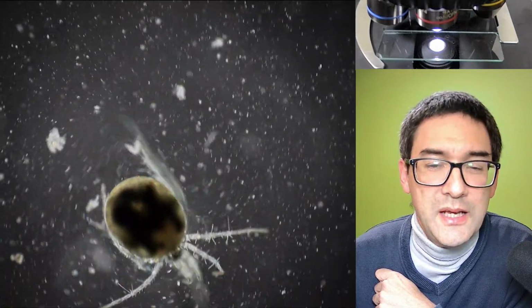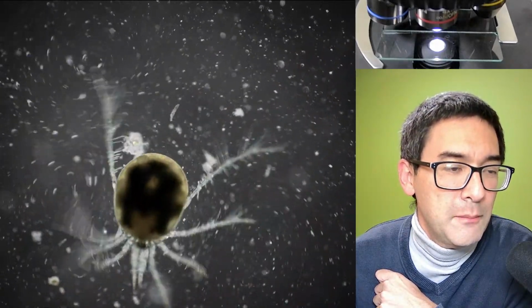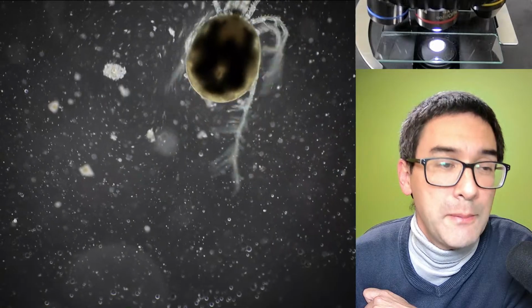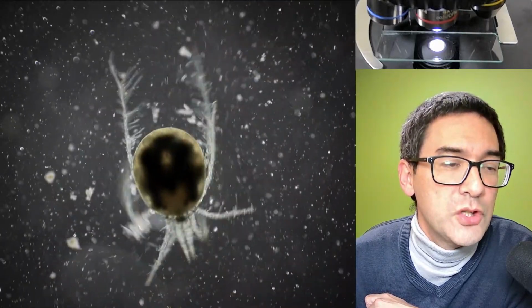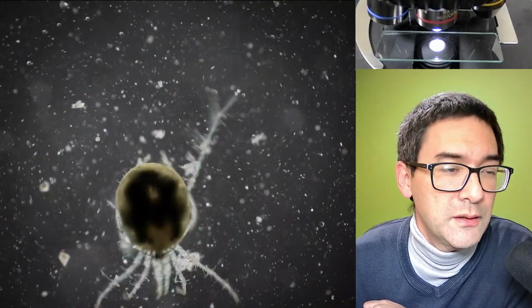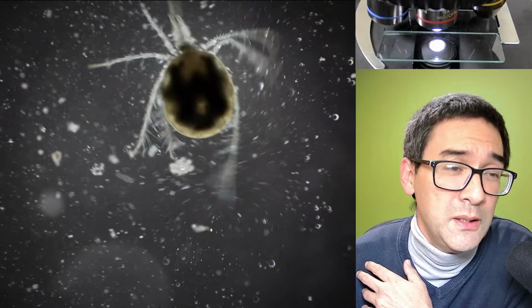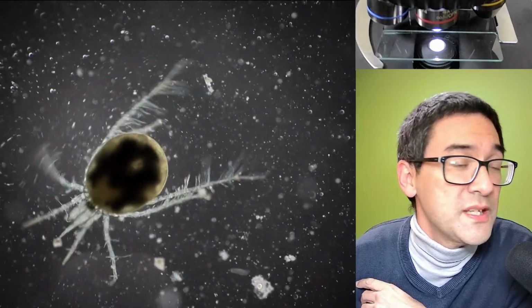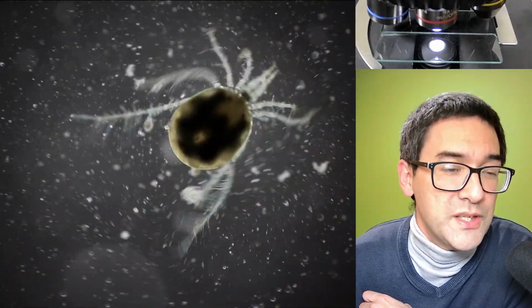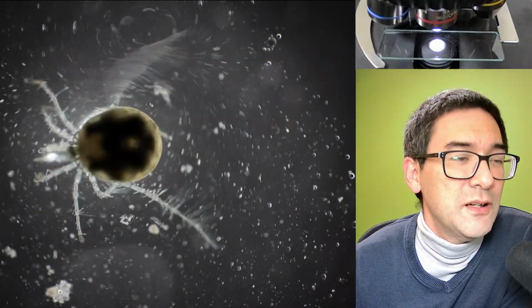I'm also seeing that somebody's just commenting that this might be a concentration issue. That is also correct. However, I did try some time ago, actually several months ago, where I took a fresh chili pepper and directly put the juice of the chili pepper on Paramecia, on single-celled organisms, and they actually did respond to that. And I can imagine that larger organisms, like for example this mite over here and also the flatworm, because they're made of many cells, it simply takes longer for the organisms to actually absorb the substance, so for it to become effective. So this could also be a reason. But in any case, I think it's still interesting and fascinating to observe here.